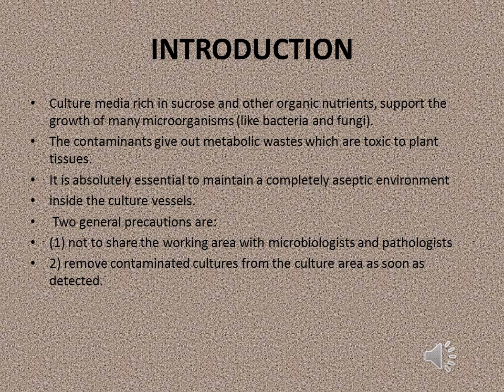There are two general precautions. First is not to share plant tissue culture working area with the microbiologist and pathologist. Second is remove contaminated cultures from the culture area as soon as detected.